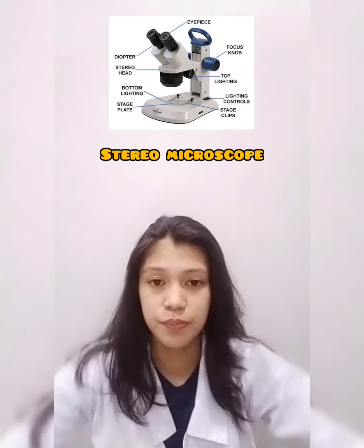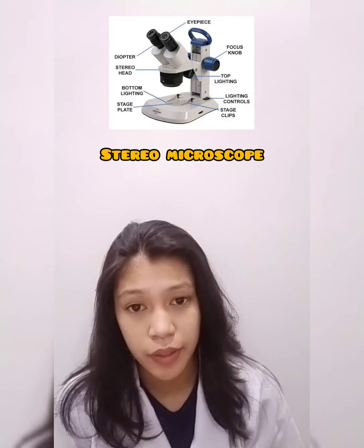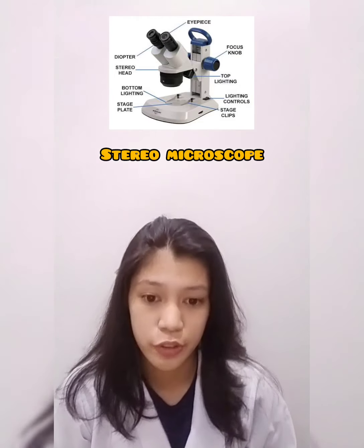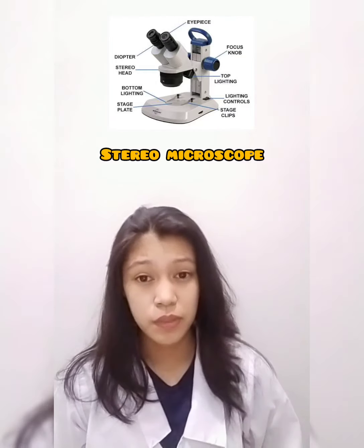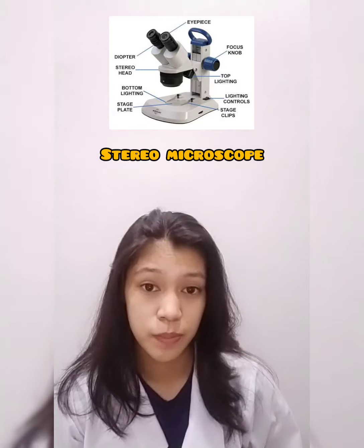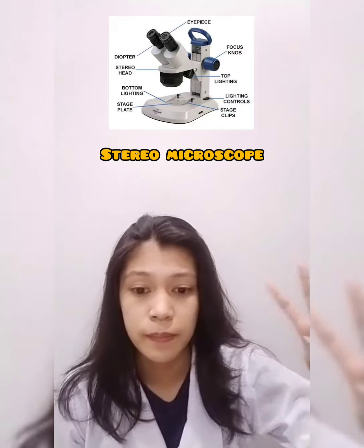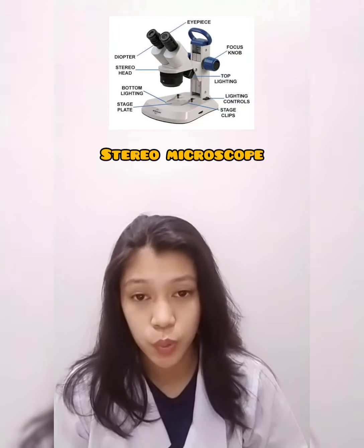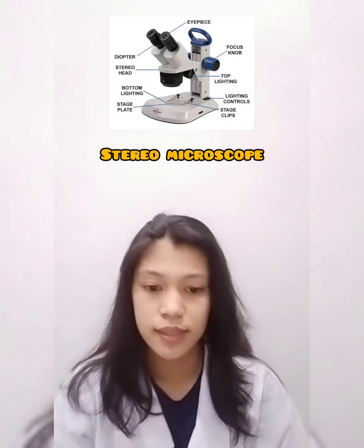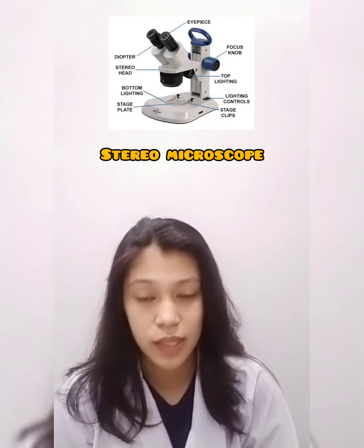The second instrument is the stereo microscope. The stereoscopic or dissecting microscope is an optical microscope variant designed for low magnification observation of a sample, typically using light reflected from the surface of an object rather than transmitted through it. The instrument uses two separate optical paths with two objectives and eyepieces to provide slightly different viewing angles to the left and right eyes. This arrangement produces a three-dimensional visualization of the sample being examined.